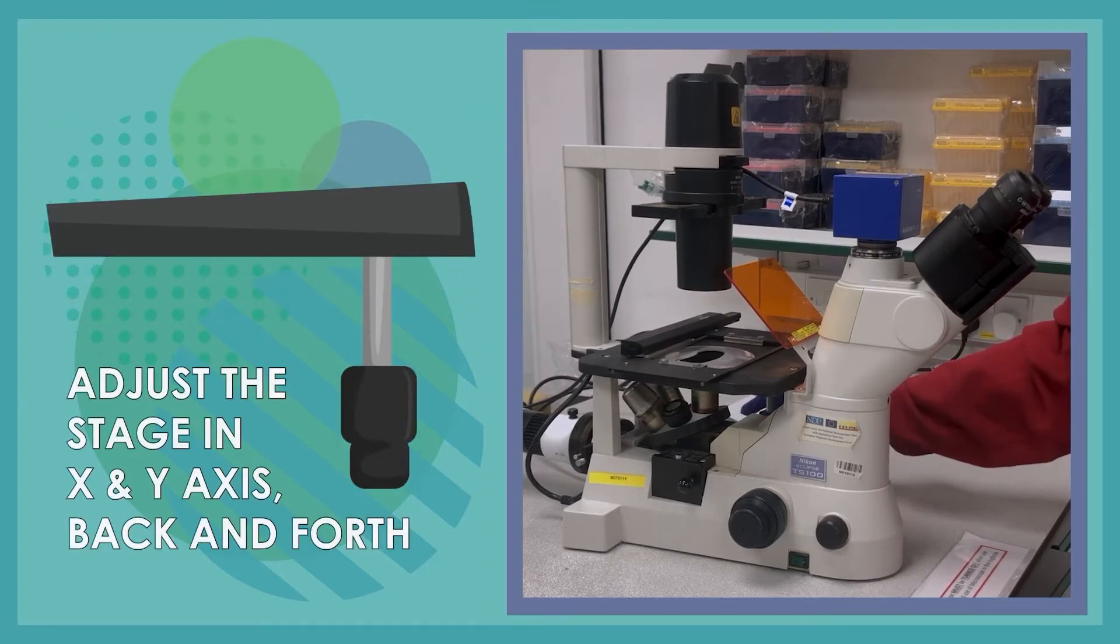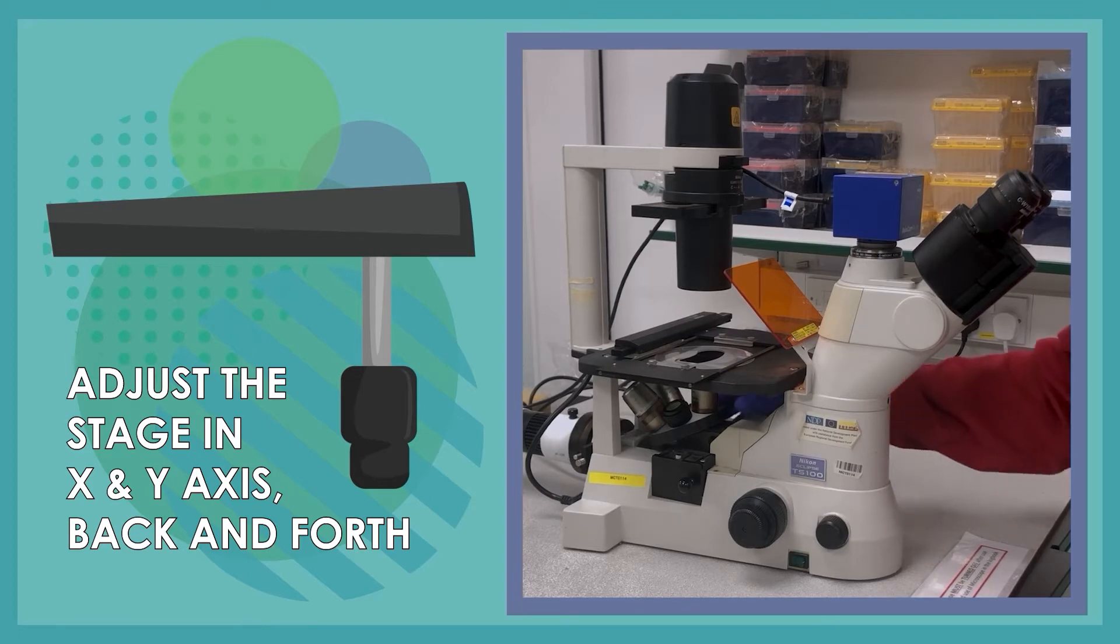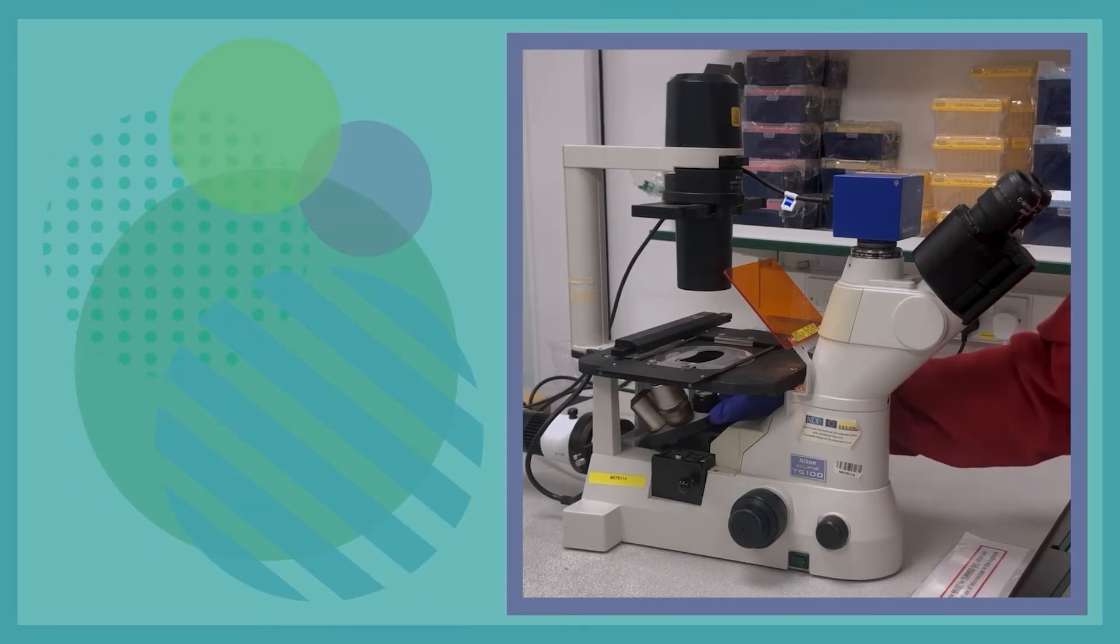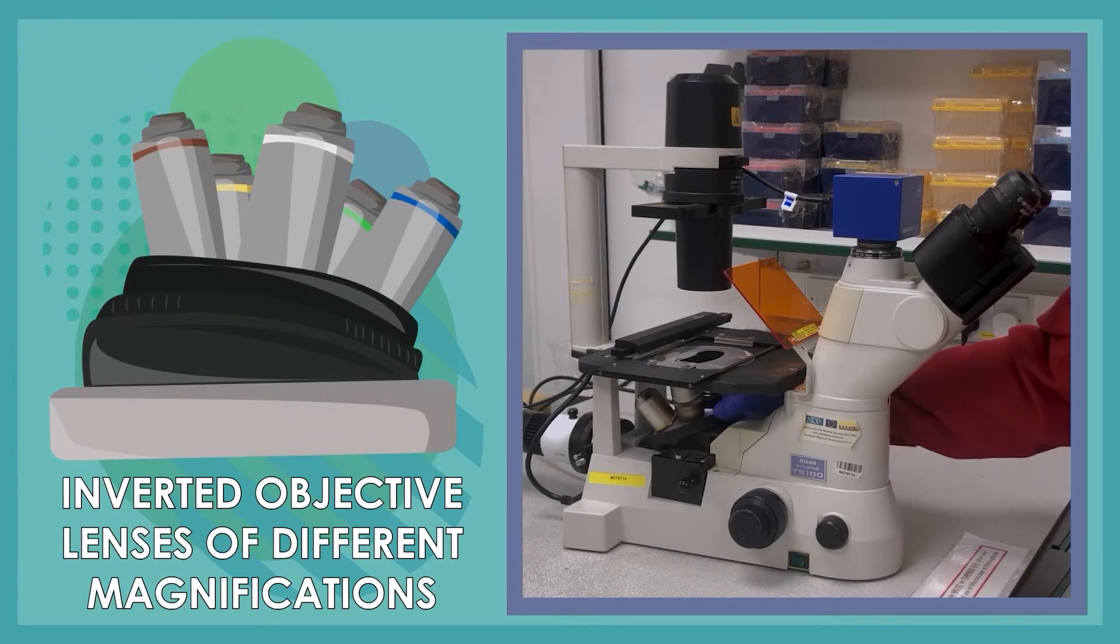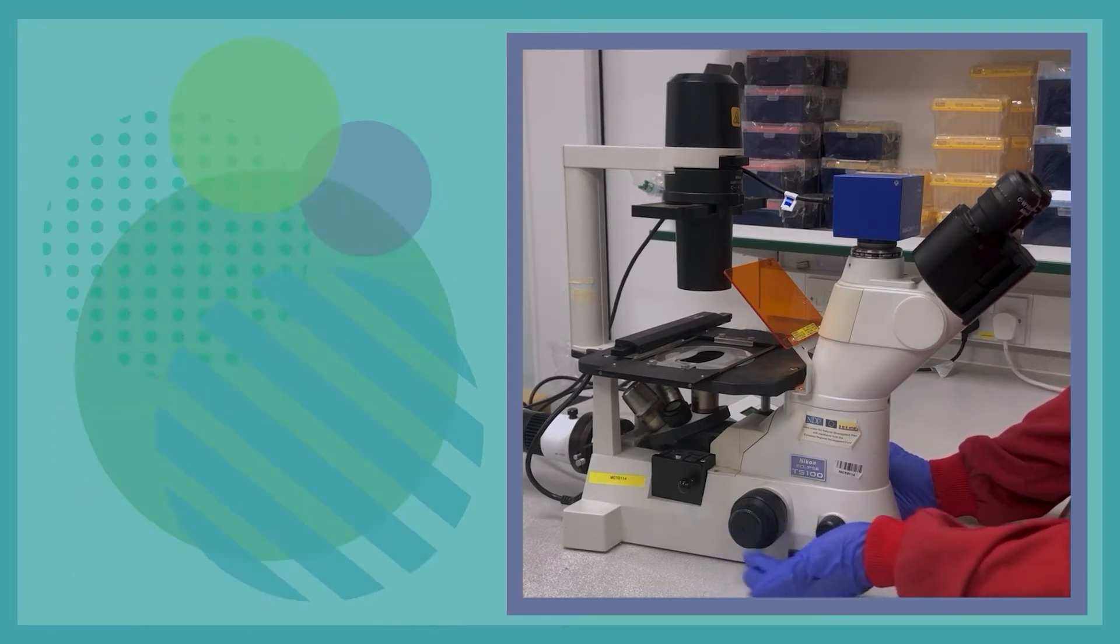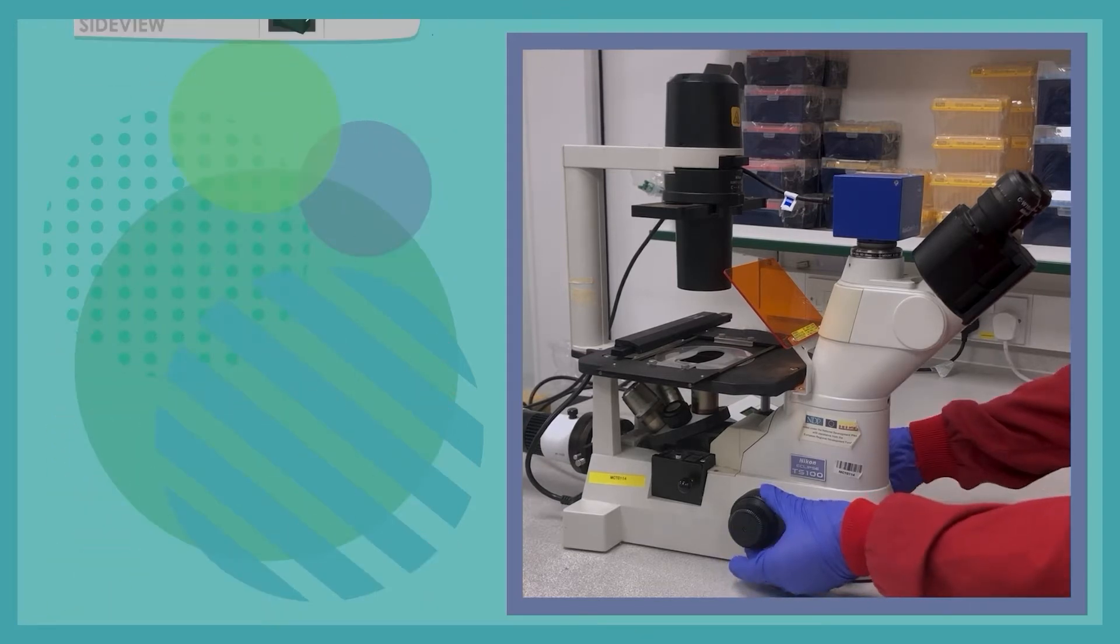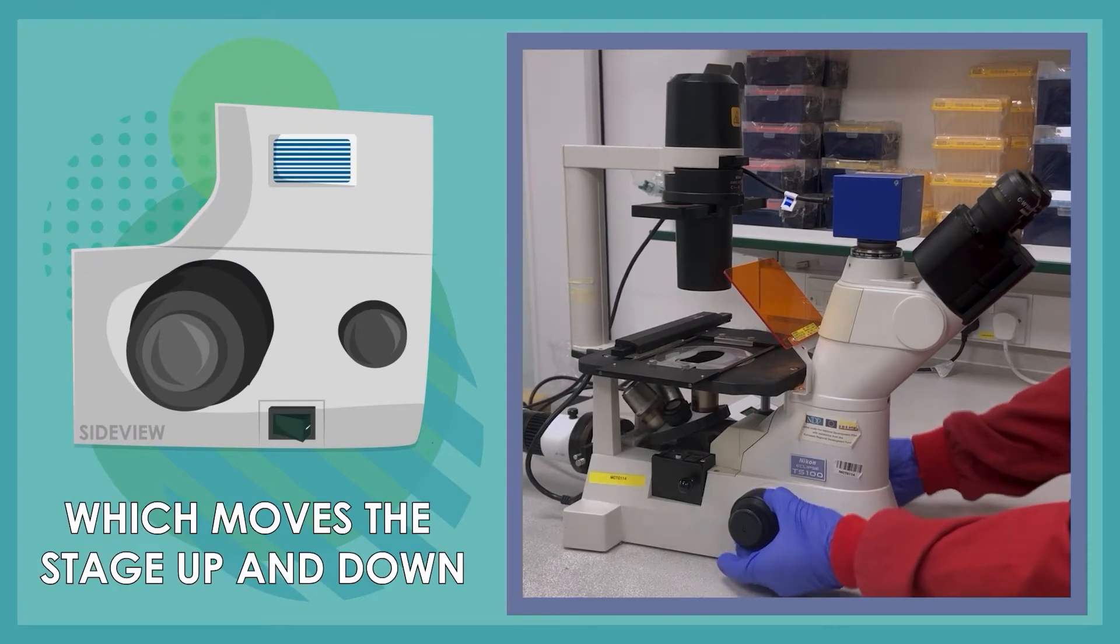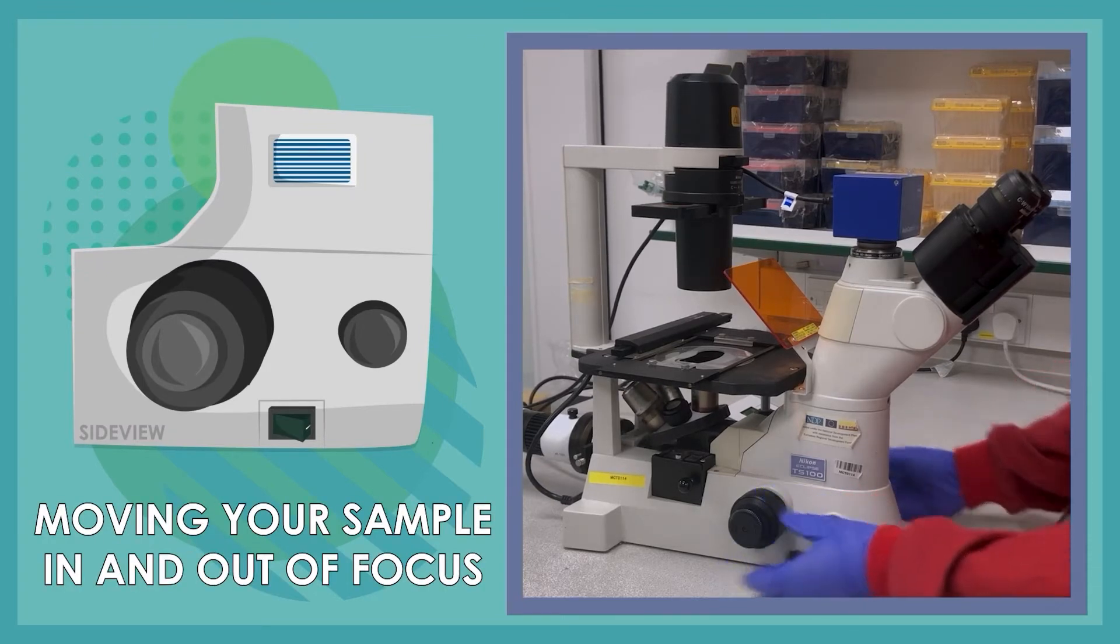You can adjust the stage in an x and y axis back and forth using the adjustment knob on the side. Below the stage are the inverted objective lenses of different magnifications which let you view your cells at different levels. Additionally, we also have the coarse and fine focus knob which moves the stage up and down, moving your sample in and out of focus.